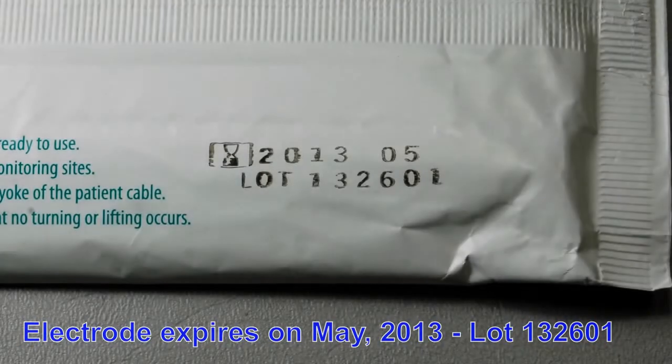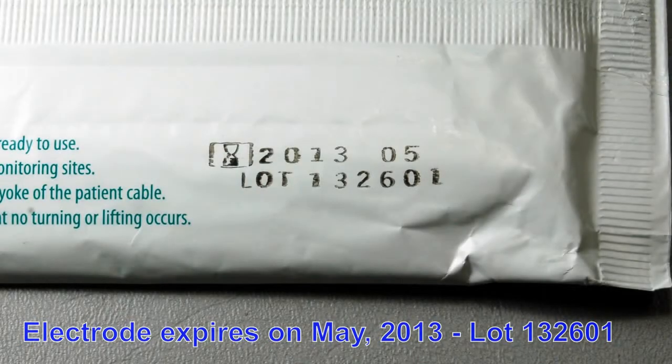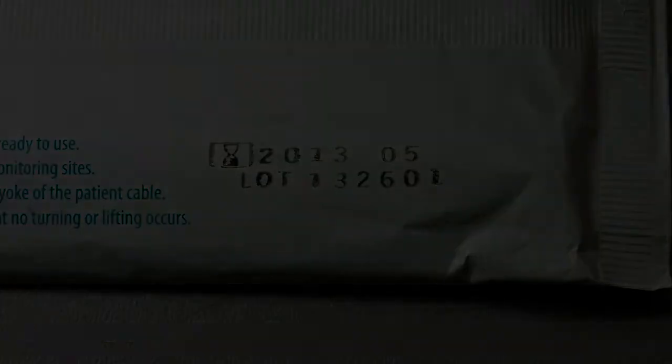And with the 2013-05 expiration date, you can see drifts in numbers, negative numbers, or extremely high numbers.